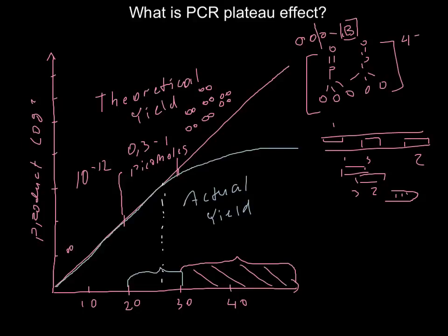At the plateau stage, accumulation of undesirable products continues while the target product does not increase — this is the stage we want to avoid. PCR generally provides best results between 20 and 30 thermocycles.